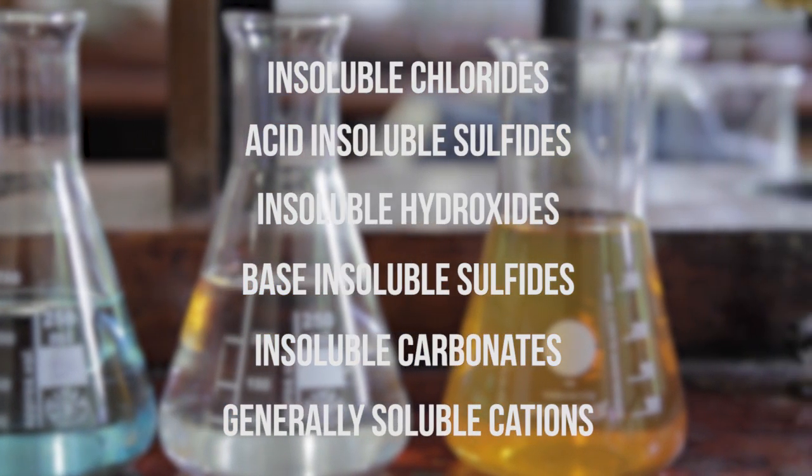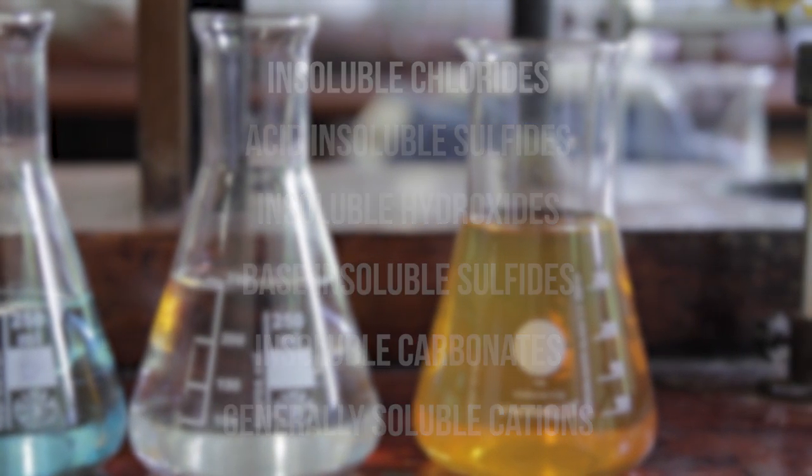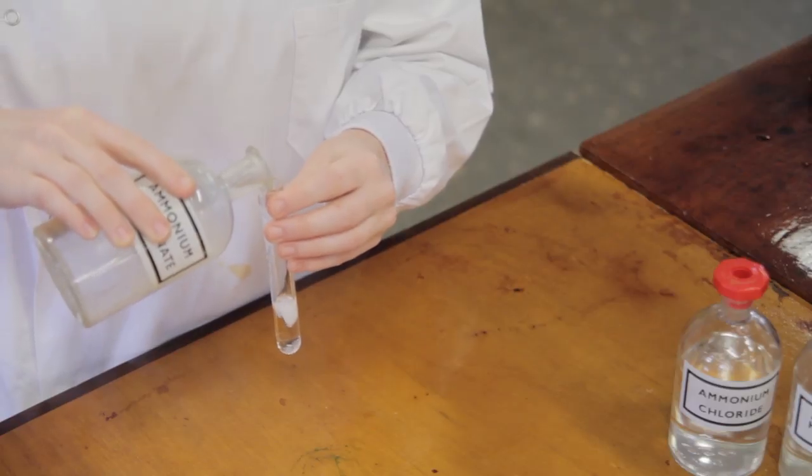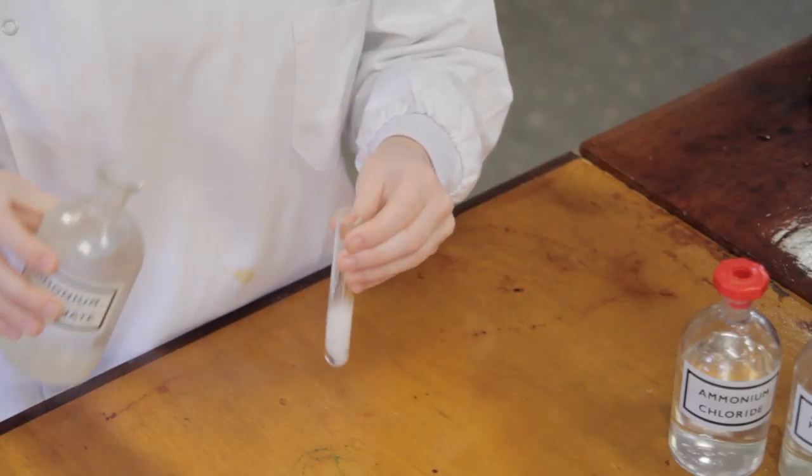Each group can be distinguished based on the reactions it undergoes. The individual cation can then be determined using confirmatory tests unique to that cation.